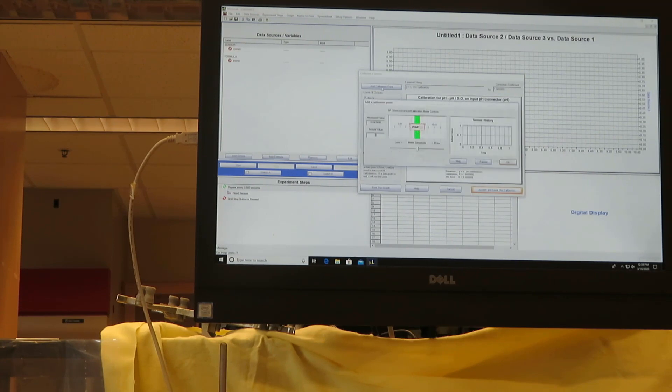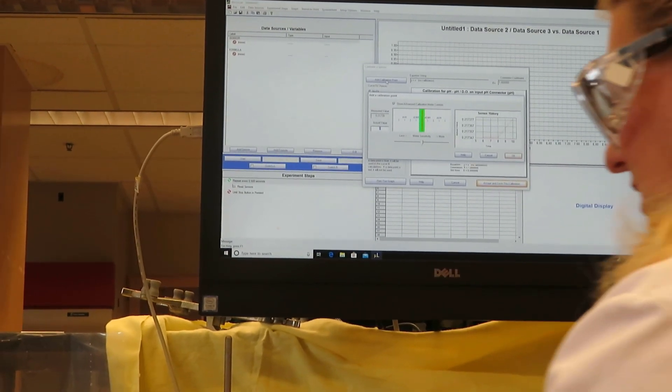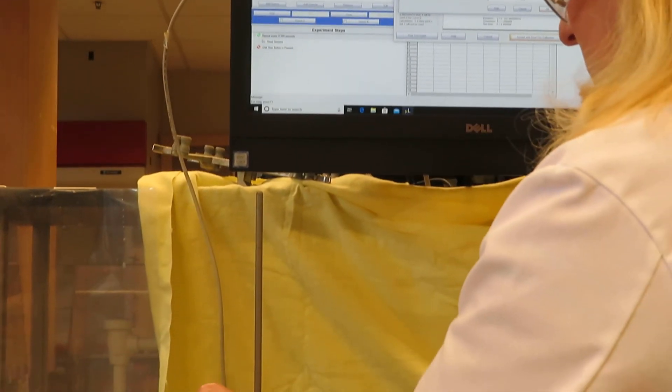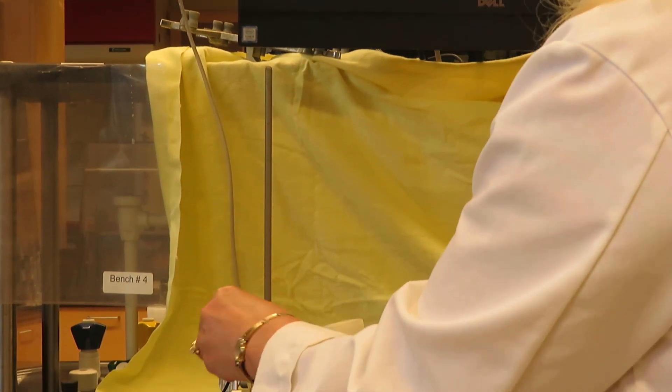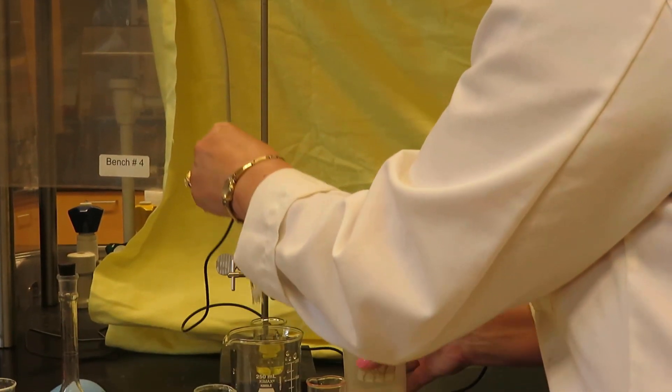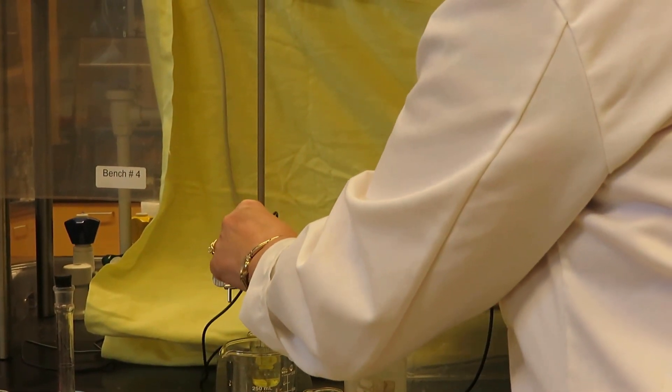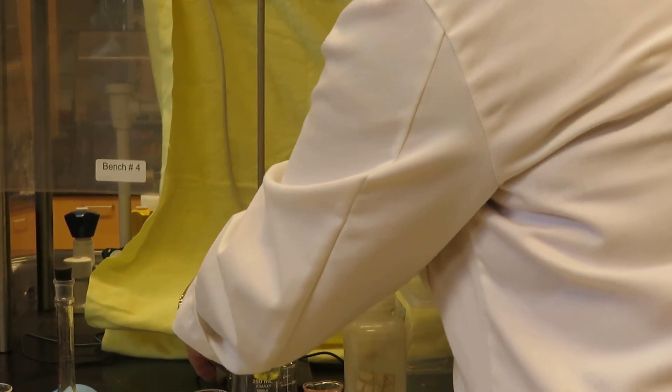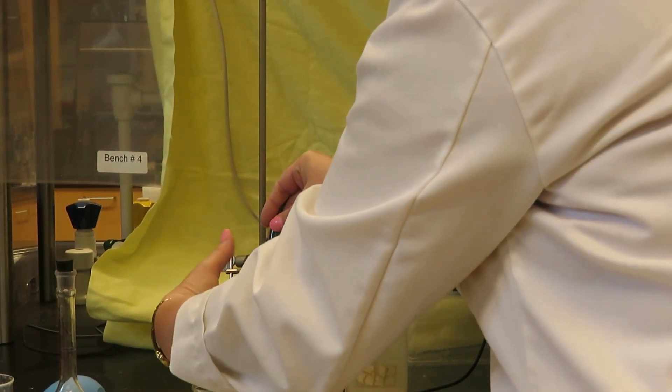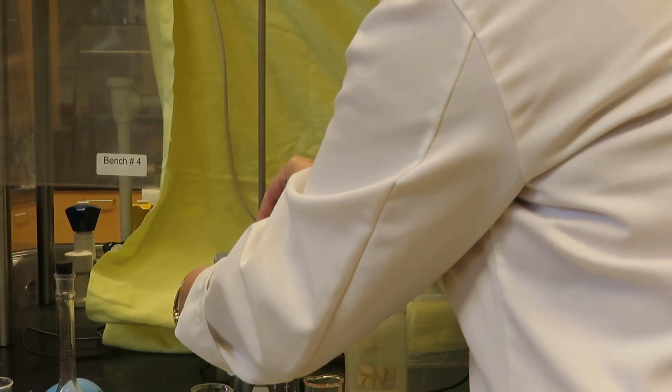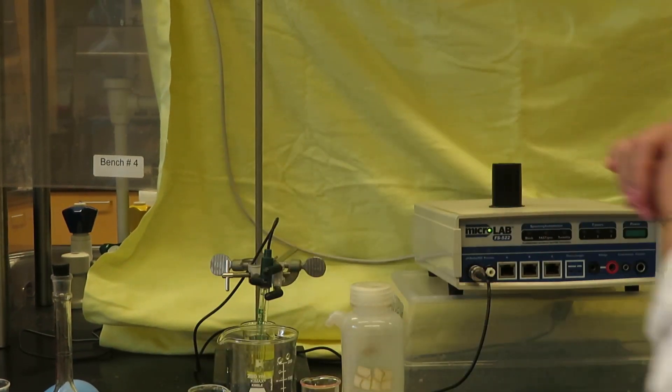Now I will add my next calibration point. I'm going to take this out of the pH 4 buffer, give it a rinse and a shake, and now put it in this yellow pH 7 buffer. I hope you can see that from the camera.